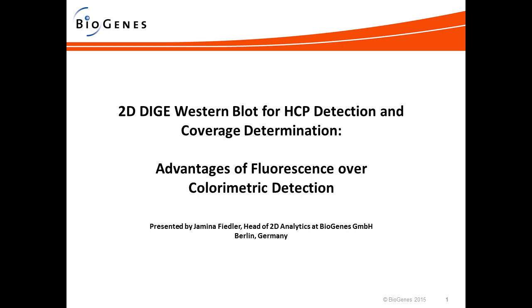I think it has to do with how bright the fluorescence is, and if you do it multiple times, does it get lighter as you go on? No, I can scan the membrane again and again. Maybe if I scanned it 20 times it would get less bright, but I haven't checked. I have never done it that often. I store them in the dark, so I can scan them a month later again.